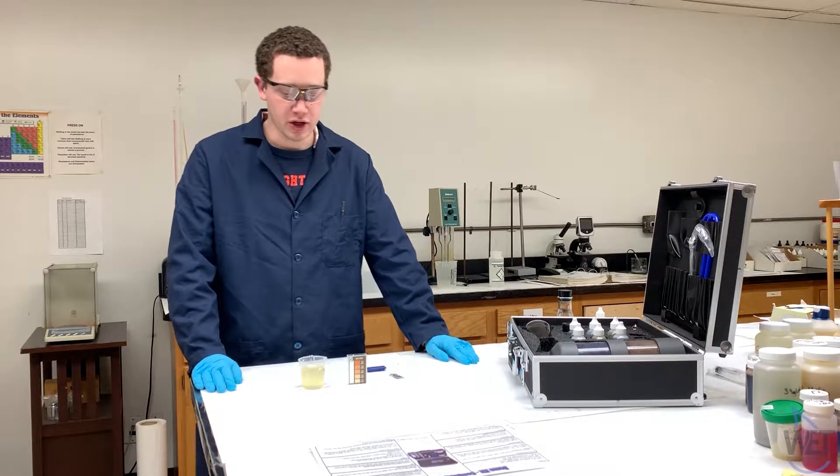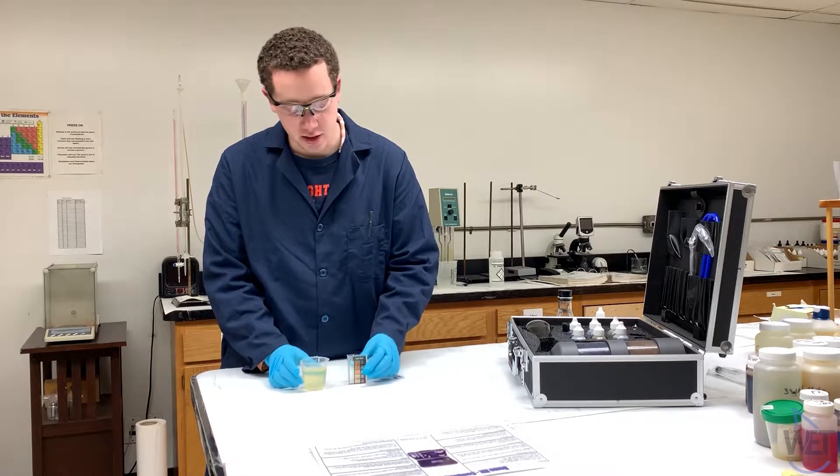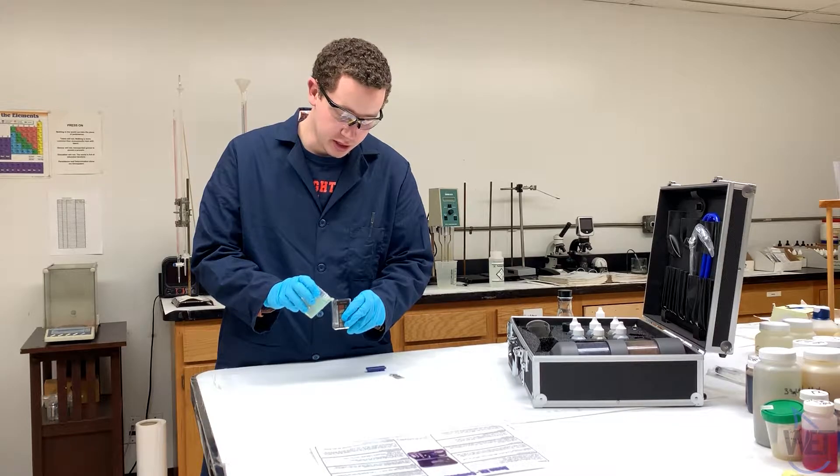For the iron test, you're going to take your sample of water, most likely containing iron, and fill the comparator up into the line.